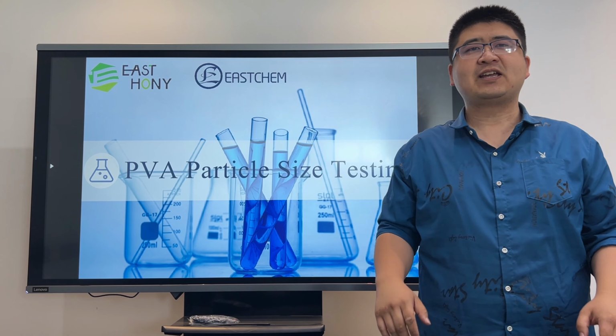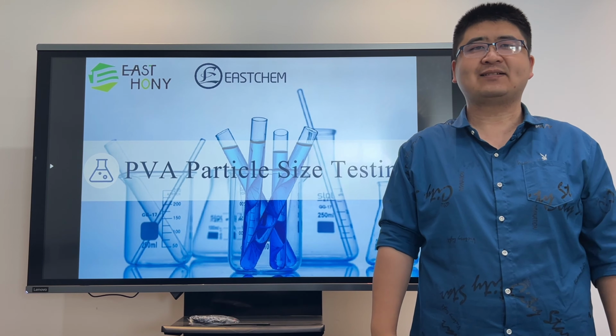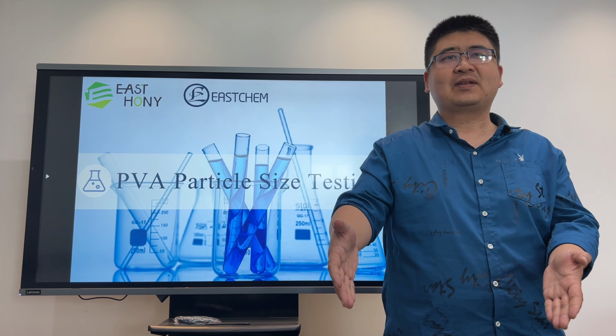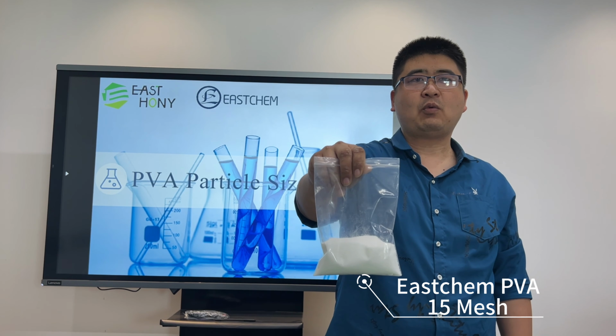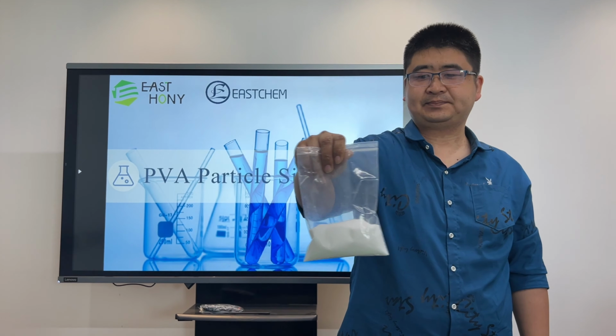Hello everyone, today we are going to do the PVA particle size test. Now we need instruments. Here is an EASTHONY PVA example, 100 grams, 15 mesh.